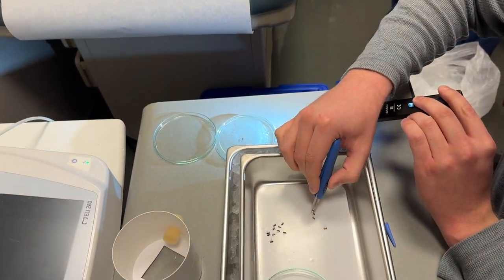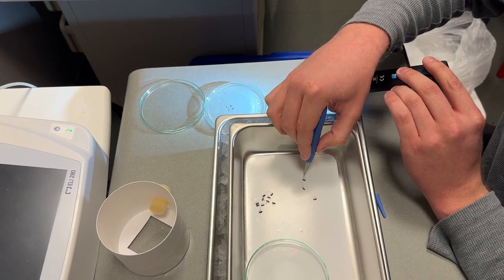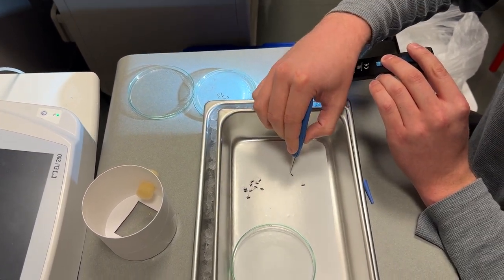The ethanol will fill their respiratory system and cause their scales to delaminate, which will kill them very quickly.